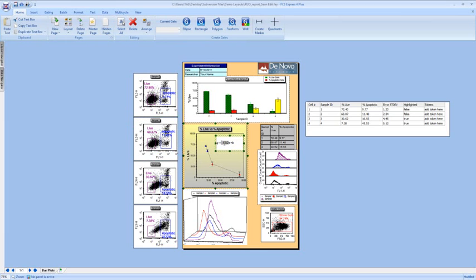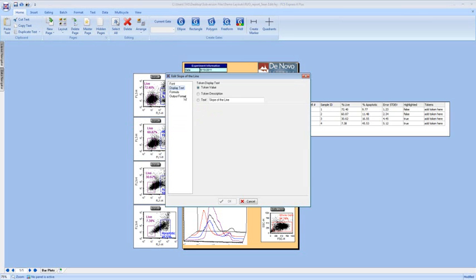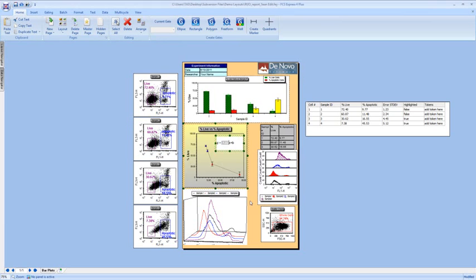And you'll also notice that our slope here, our M value, is actually being calculated by a custom token, and it's just using the equation for the line here that's coming from a bunch of different statistical parameters within FCS Express. So this is flow data that you're seeing right now.